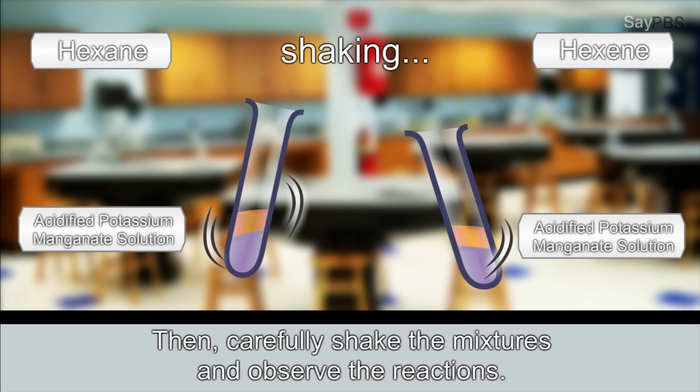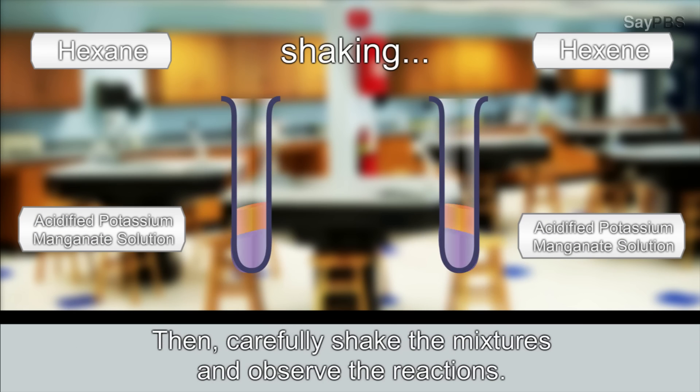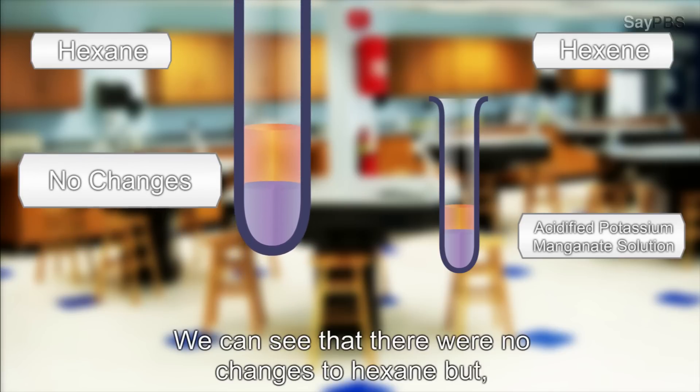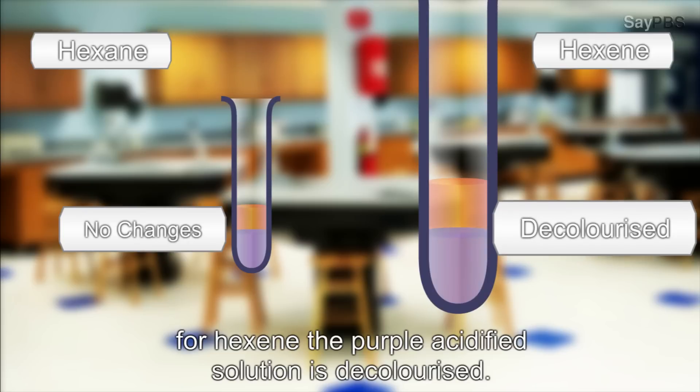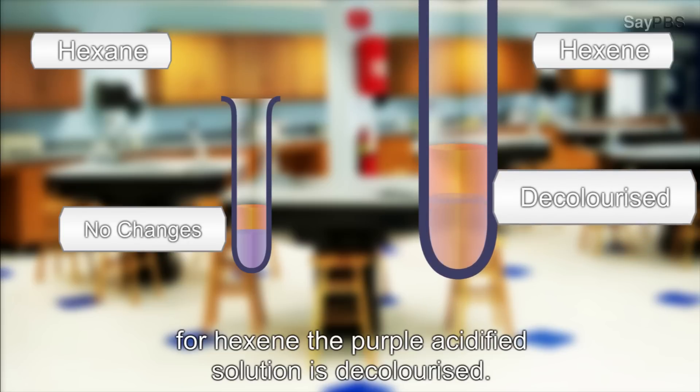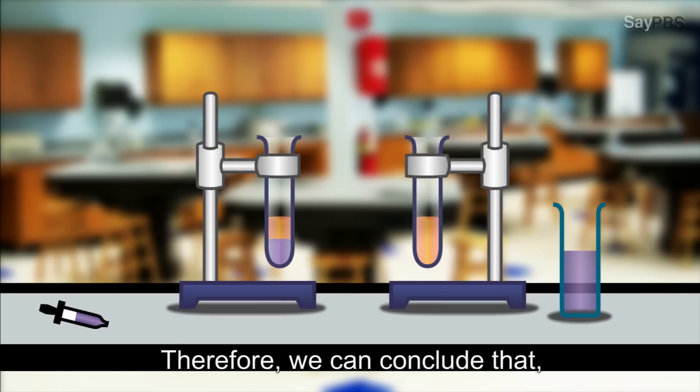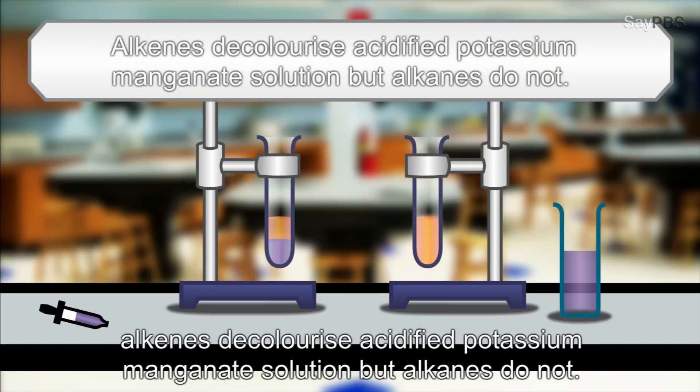Then, carefully shake the mixtures and observe the reactions. We can see that there were no changes to hexane and for hexene, the purple acidified solution is decolorized. Therefore, we can conclude that alkenes decolorize acidified potassium manganate solution but alkanes do not.